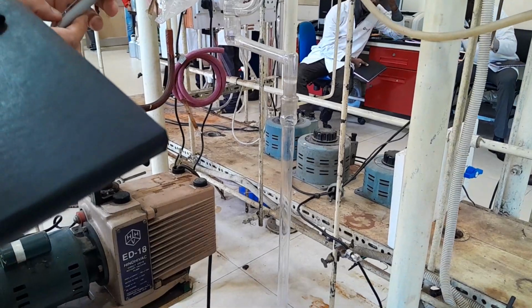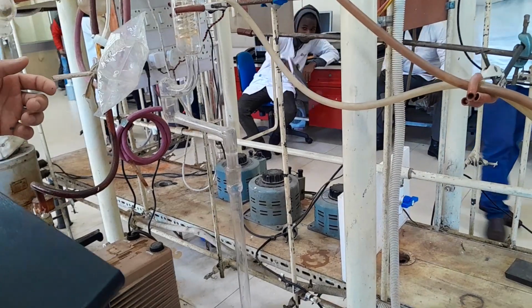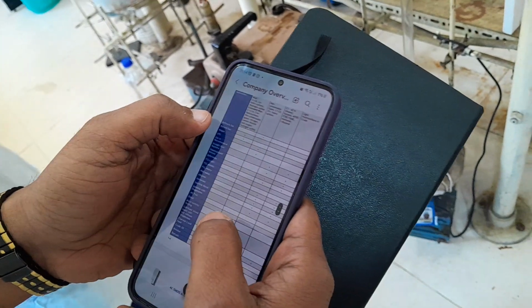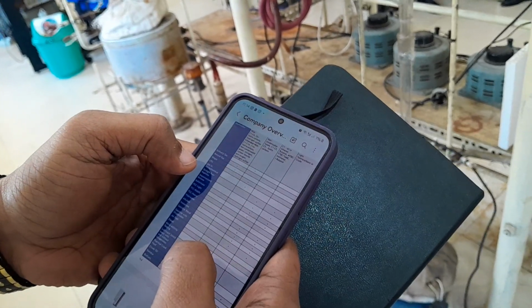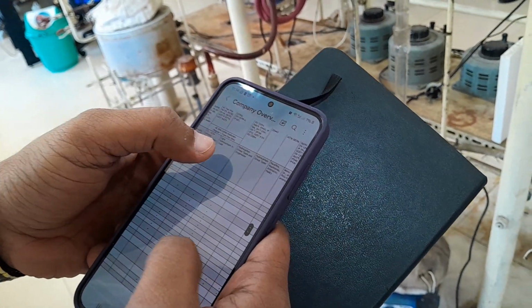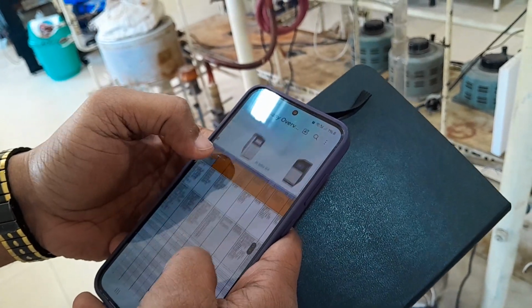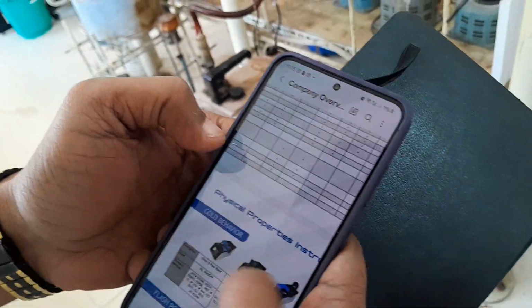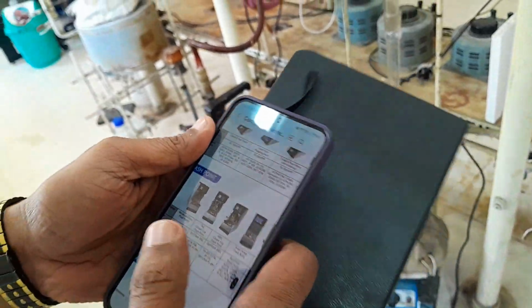Oh, you have internet, right? This here is a company that I spoke with. They have all equipment for oil and gas testing. You see, for each aspect, refined gas, natural gas, biogas, LPG, and petroleum, there are different instruments along with the ASTM methods. So this is a GC, an Agilent platform. I guess they even have an automated one.